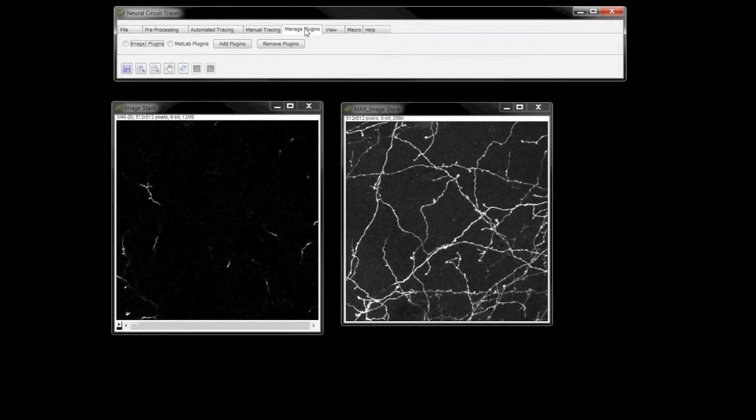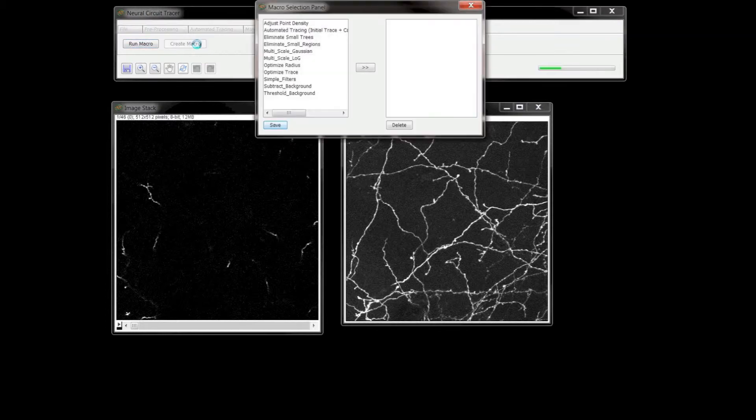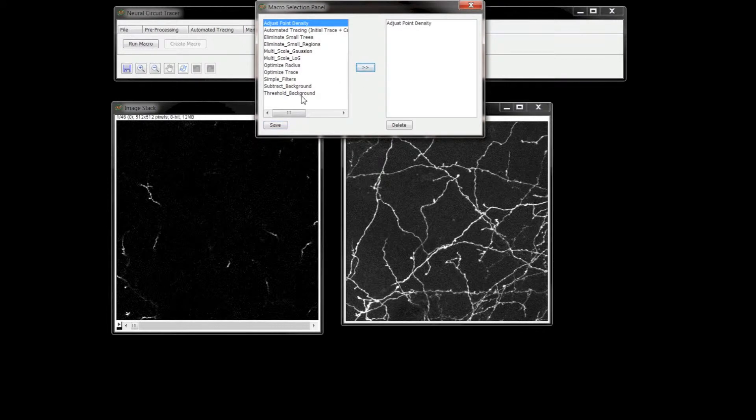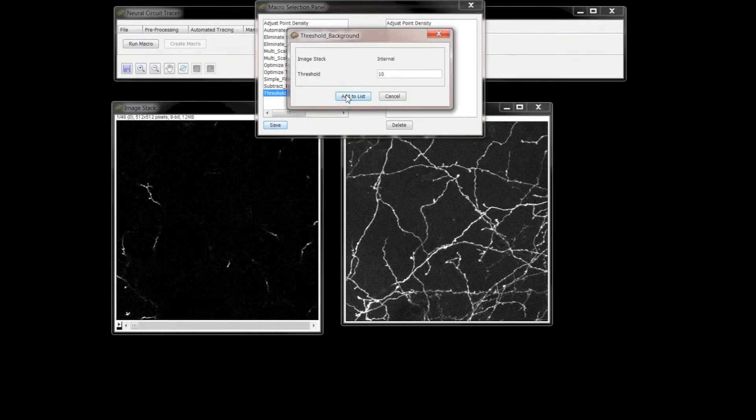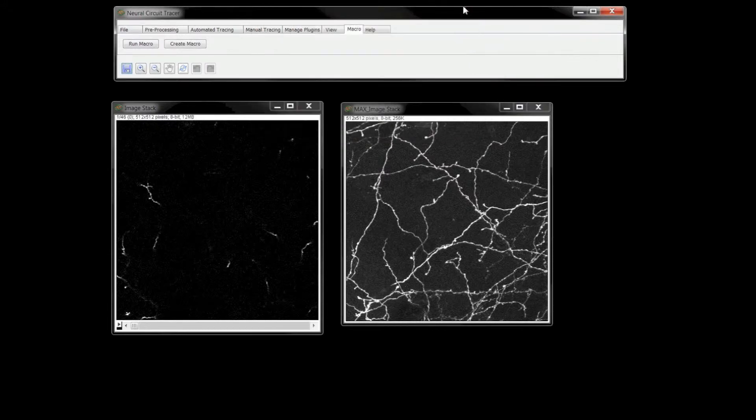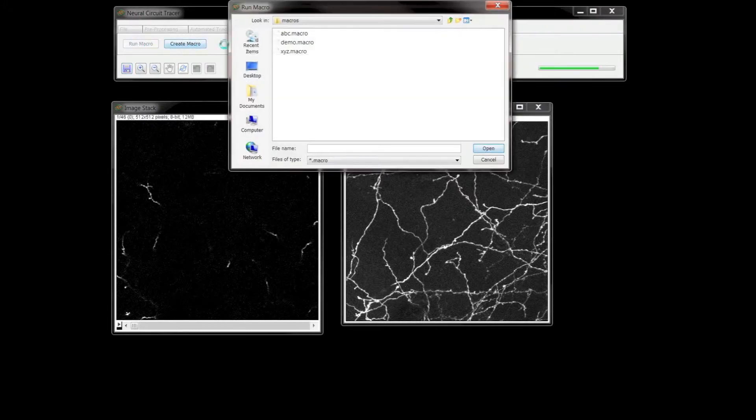Native pre-processing steps along with automated tracing capabilities can be bundled together and saved as a macro. Let me use a macro I created earlier to perform a multi-scale Gaussian blur followed by an intensity threshold operation on the stack.